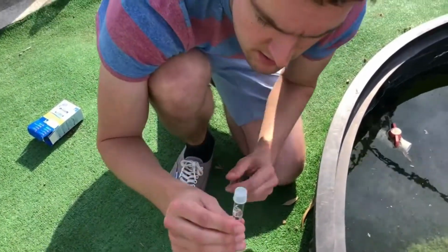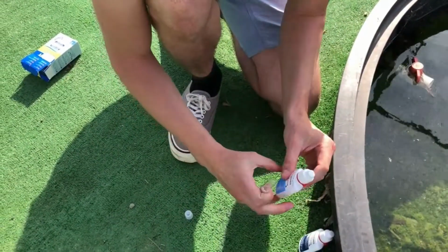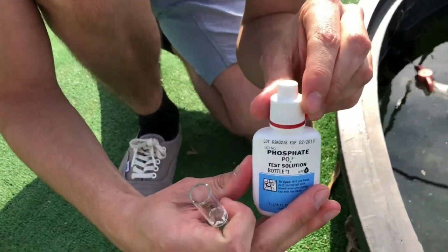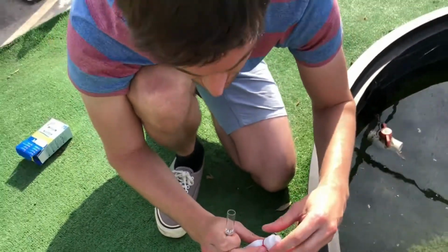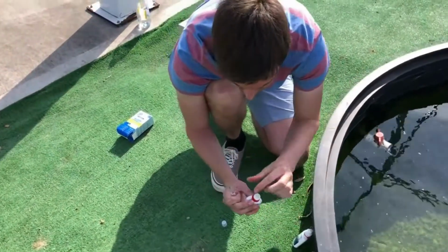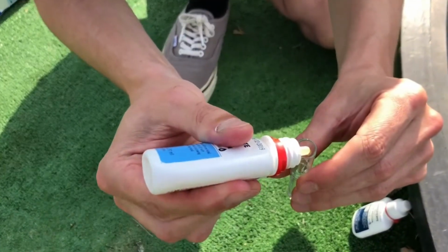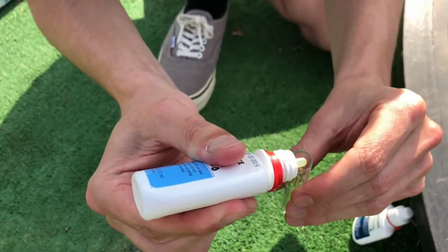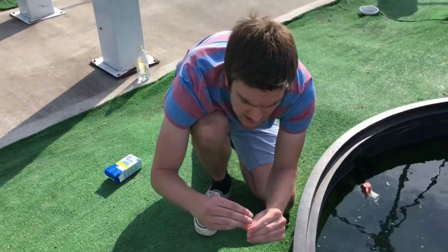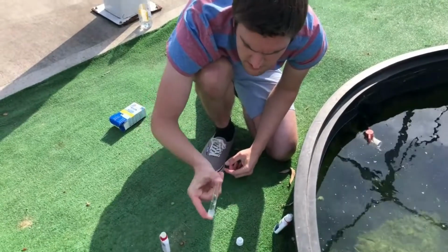Okay, so we're now using the sample we've collected, add in 6 drops from the phosphate bottle 1 reagent. So we unscrew the top off that, add in 6 drops, place the cap back on, invert the sample 5 times.